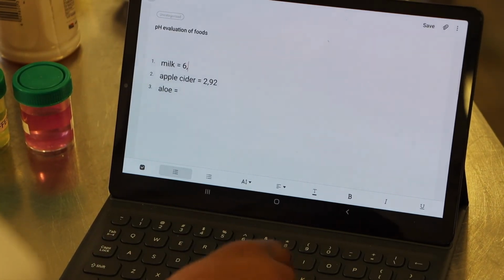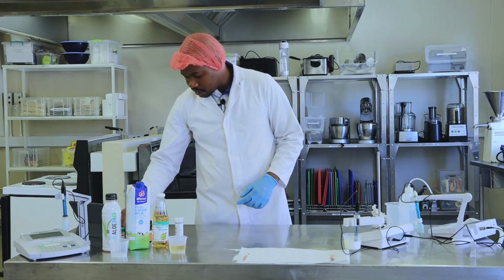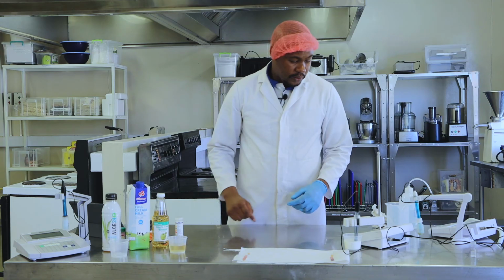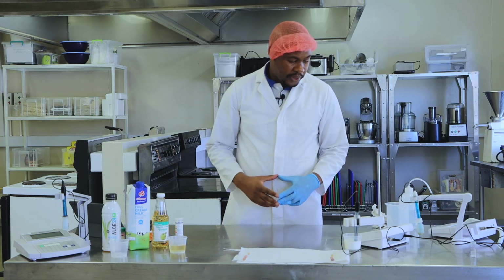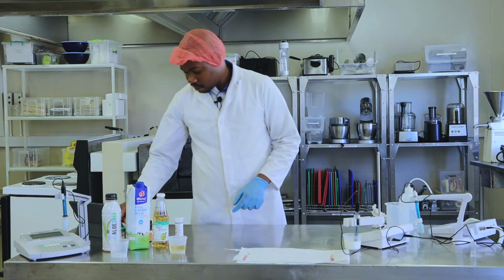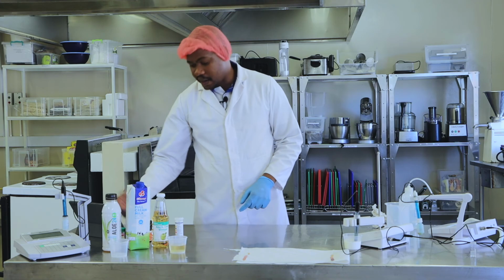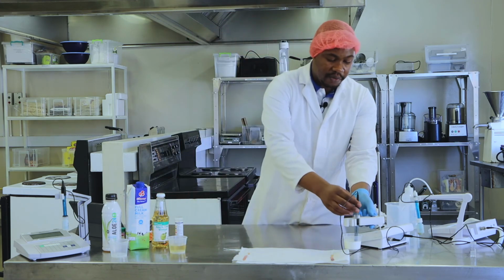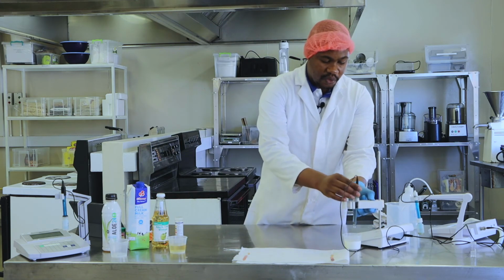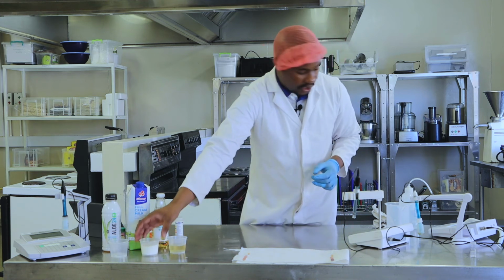So here for the milk, I'm getting 6.3. Okay, so it's 6.43. And then you take your reading, you put it down. So basically, that is what you're going to do. And then afterwards, you wash your pH probe.